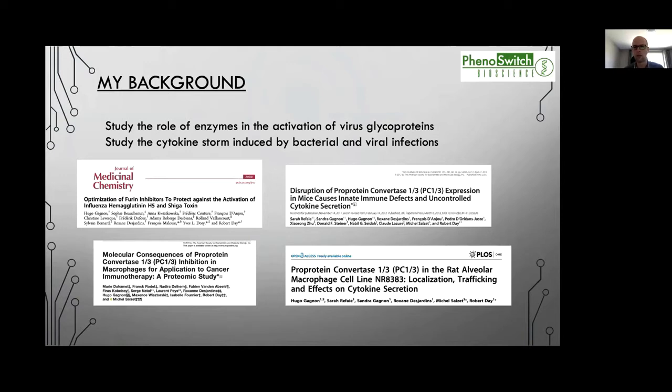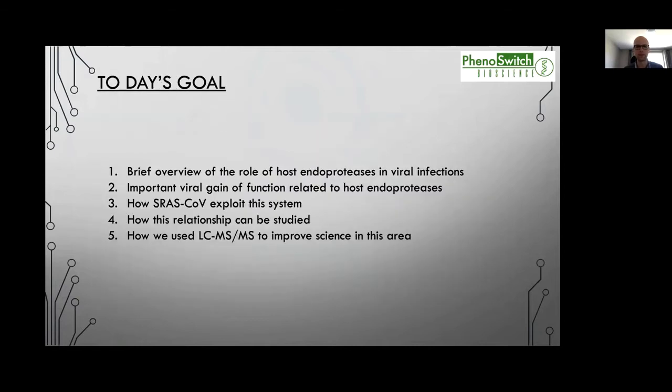And after my PhD, I started a company offering services by LC-MS, and I had the chance to actually use my knowledge around enzymology and virus activation and the mass spec field.